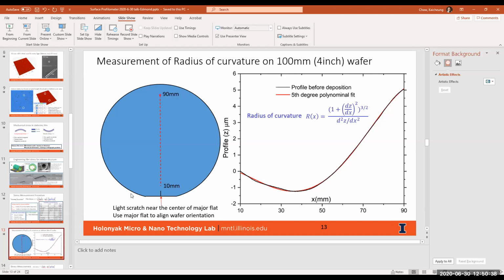When you did the live demonstration, it looks like there's some kind of mechanics of 2 points coming in together. If it's a single stylus, do you know what the 2 points are coming in from the side? One of them is the reflection. The left one is the actual stylus, and the right one is just the reflection. So when you come into contact, you see 2 of them touch.